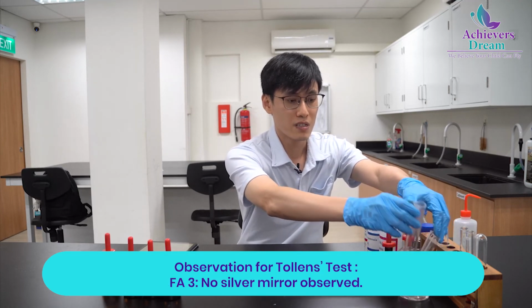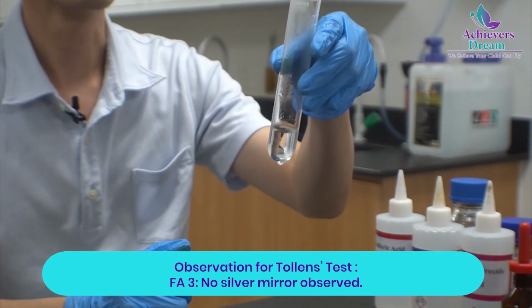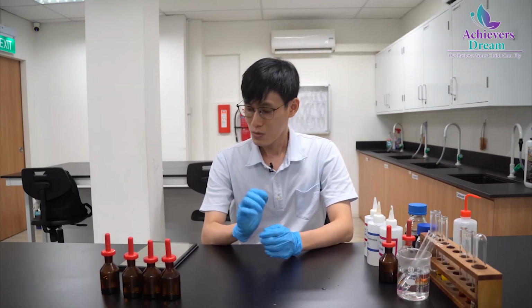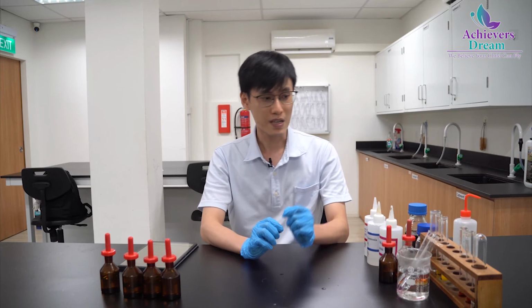Let's check on the Tollens' test that we did just now. As you can see, there's no silver mirror. That means Fa3 does not contain the aldehyde group. So while waiting for our KMnO4 test results, we will move on to part D, which is the iodoform test.